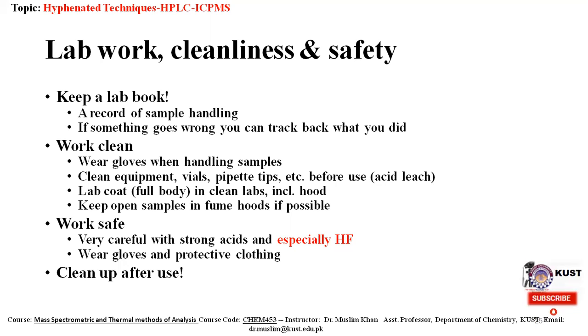Also, wear a lab coat, full body in clean labs, including hood, and keep open samples in fume hoods if possible, not to contaminate, or even because some fumes are dangerous. So that's why keep open samples in fume hoods, and work safe. Be very careful with strong acids, especially hydrofluoric acid.